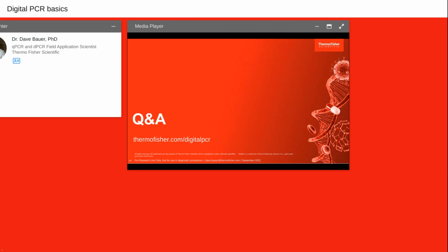Okay, great. Thank you. All right, your next question. Since the dynamic range of digital PCR is smaller than real-time PCR, how confident can we be that our measurements are within the dynamic range of the instrument?